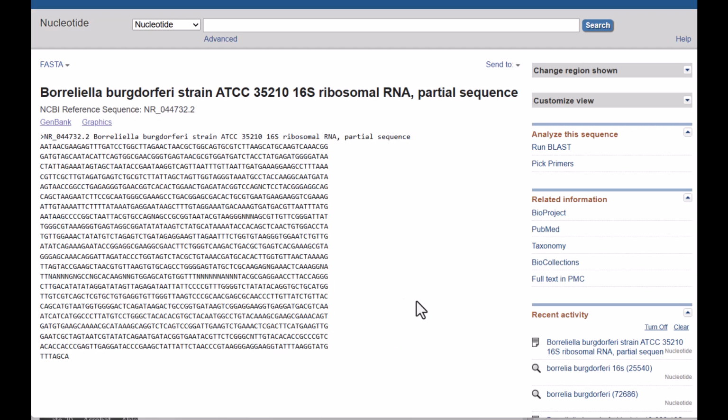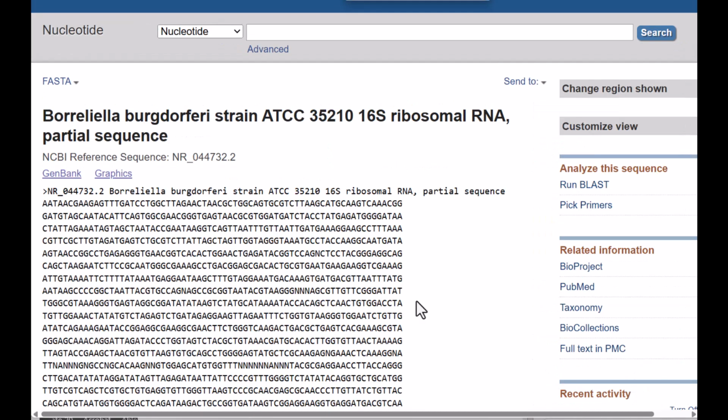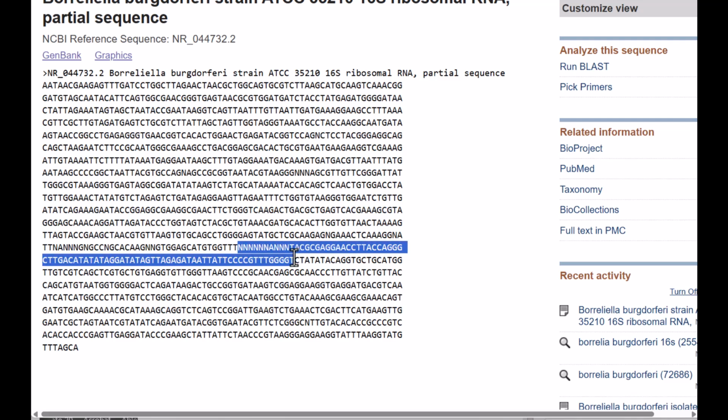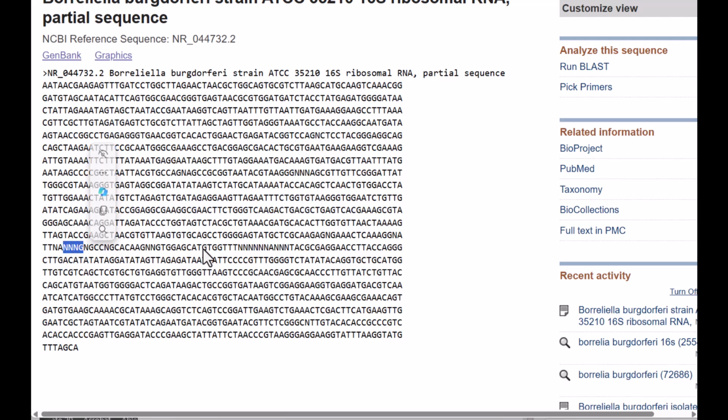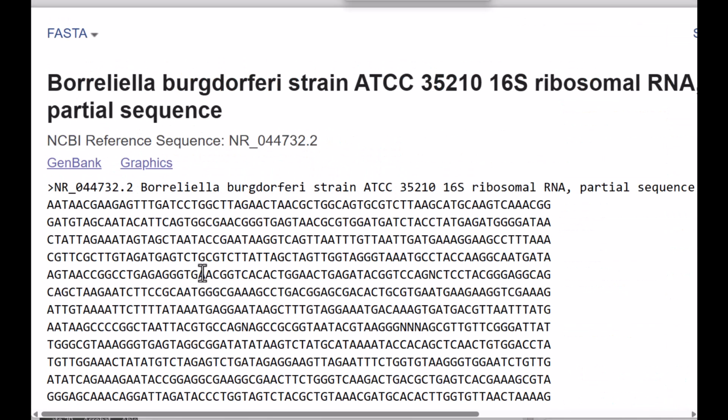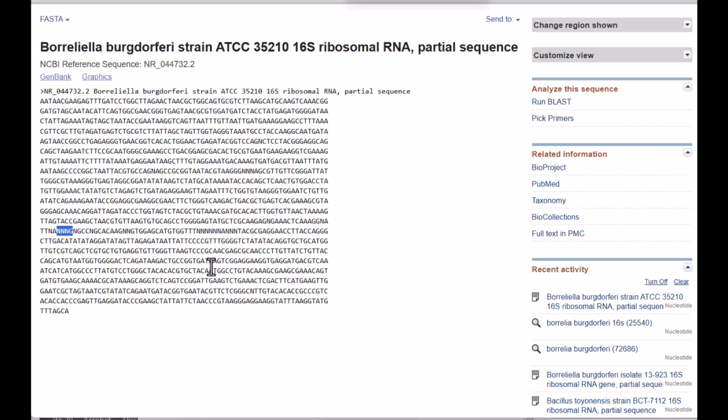And if you're looking at the sequence, actually pay attention. What are the nucleotides for the DNA? It's ATCG, and you can see throughout here there's a couple of N's, and that is usually a sign that there was a problem with sequencing. So again, just pointing that out. Always keep an eye open for something that doesn't look quite right, because ATCN is not really one of the sequences. But anyway, let's compare the two sequences.